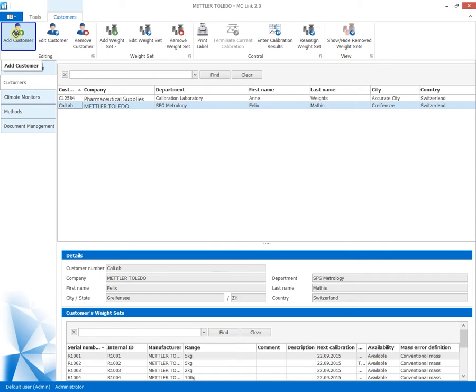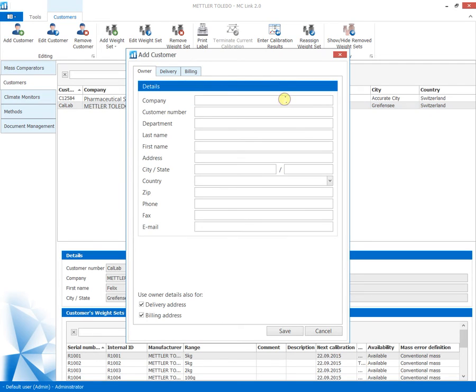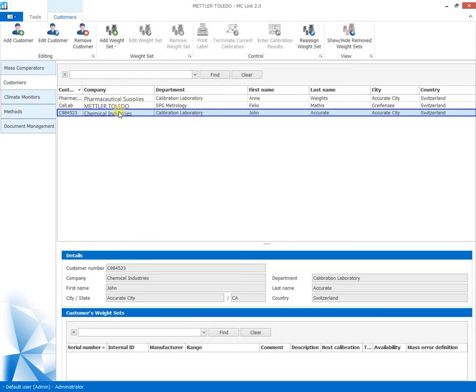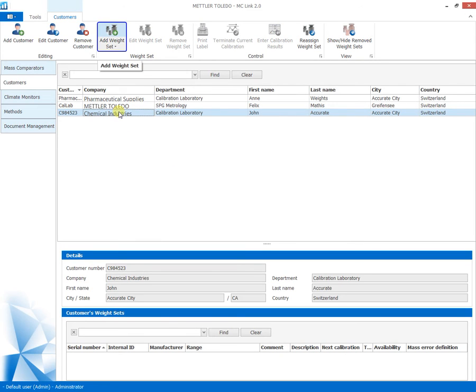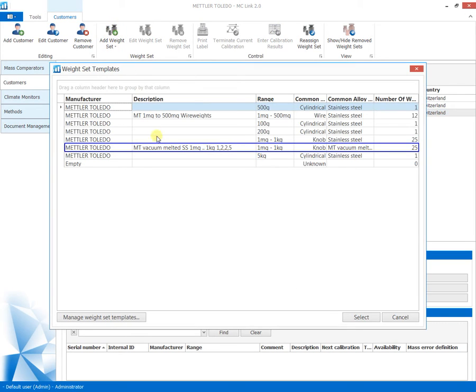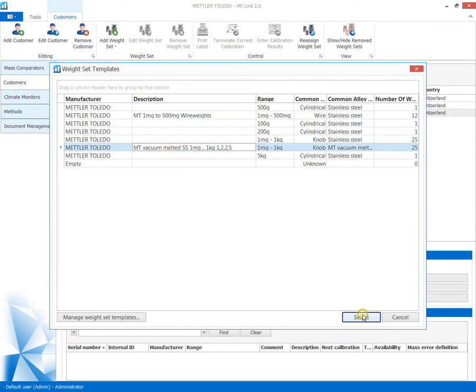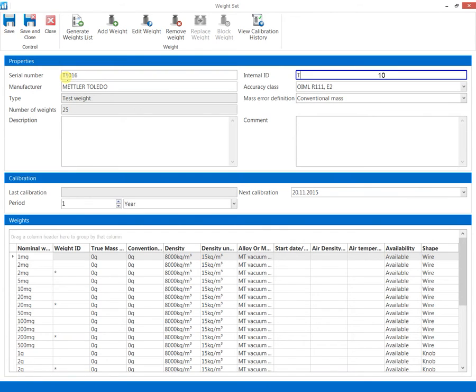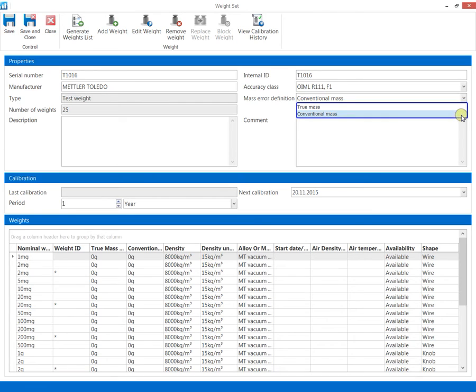Let us start the office client to begin a calibration. The customer data is entered with all relevant details. Each weight set is assigned to one specific customer. The definition of the weight sets is based on predefined templates, which can be designed with high flexibility to suit the customer. The definition of the customer weight set is done with a few clicks.